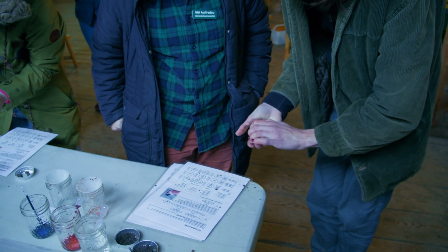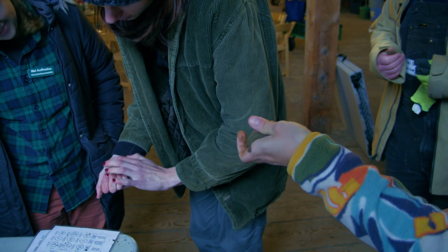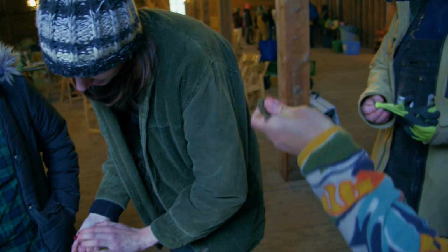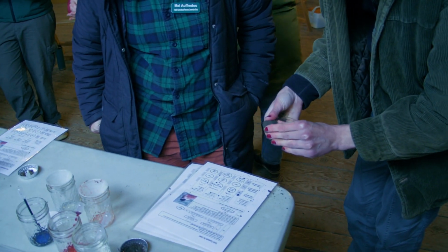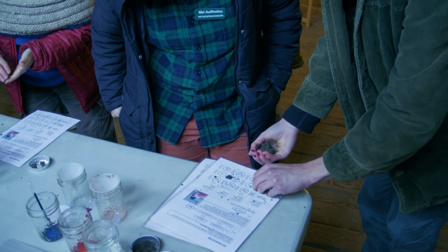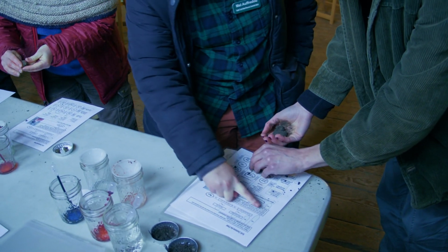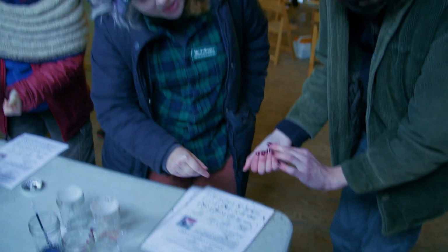And don't be afraid to really get in there when you're doing the texture. Do you feel like you need more water? Okay, I guess we do need more water. It says, "Does the soil form a ribbon?" Have you formed your ball yet? Yes. But then the ball broke apart.